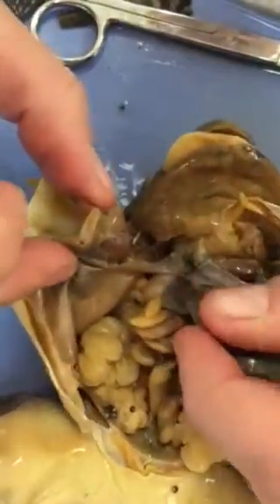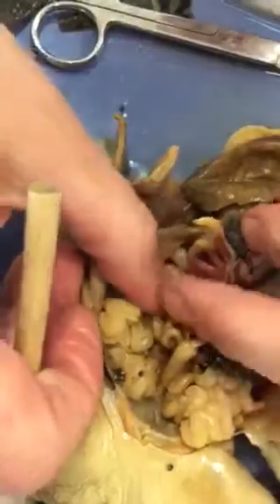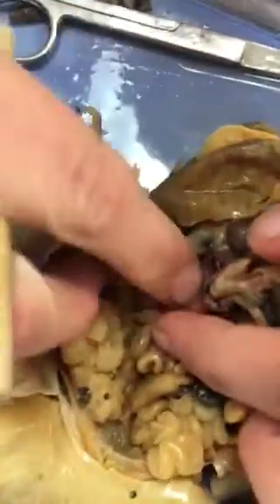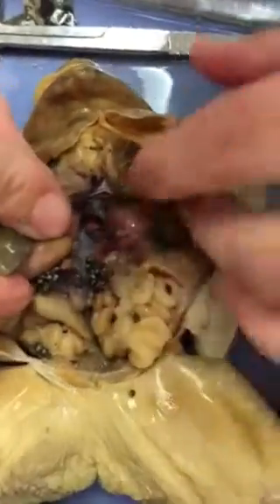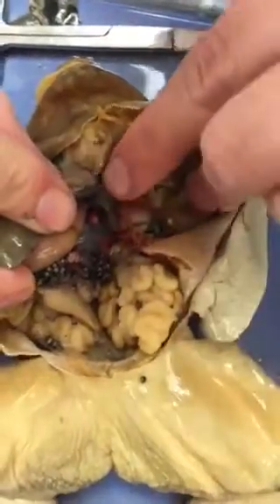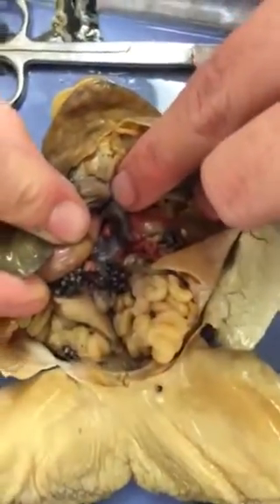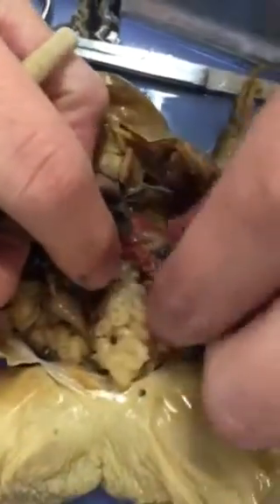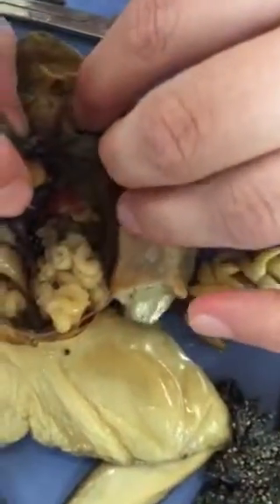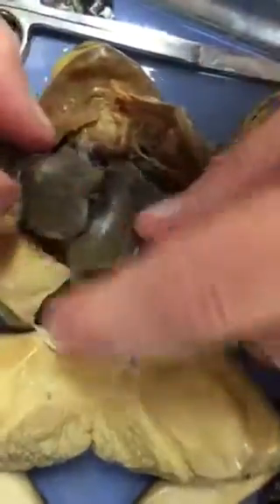Then if you lift all of this up, you should be able to find a lung. Okay, the lung, there's one right here, and then there should be one on the other side, right here. These are kind of small. Sometimes they can be longer, sometimes they're a little bit more pink. It just depends on how they preserve them. These are fat bodies. Oops, I didn't mean to pull it out. That's a fat body, and that's there to store energy for hibernation.